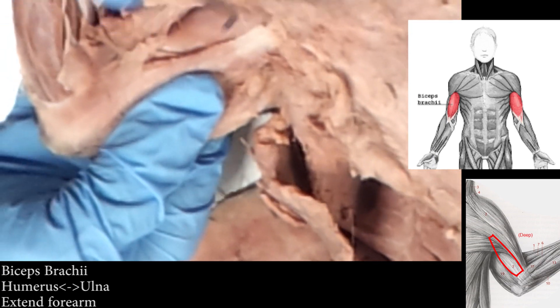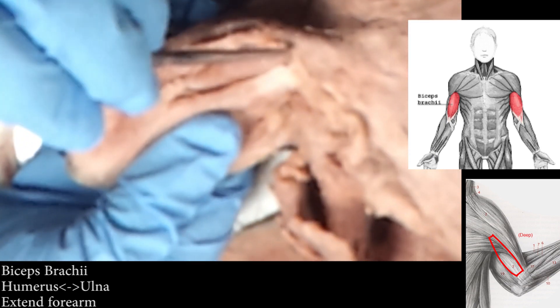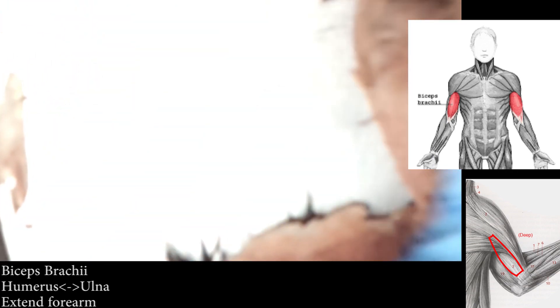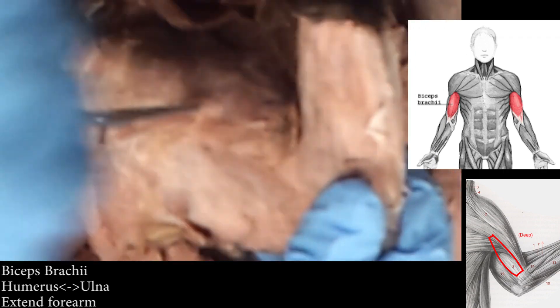Brachialis is actually on list seven — I really should have put it on list six, but whatever. So is it just underneath the pecto-antibrachialis? Yes, it's under it. See how there's a division there? The top one — the bottom one's brachialis. So right here is biceps brachii, and you can see it really well on this side. When we go inside, you'll see the brachialis. So biceps brachii, epitrochlearis — and then coracobrachialis is the fun one.